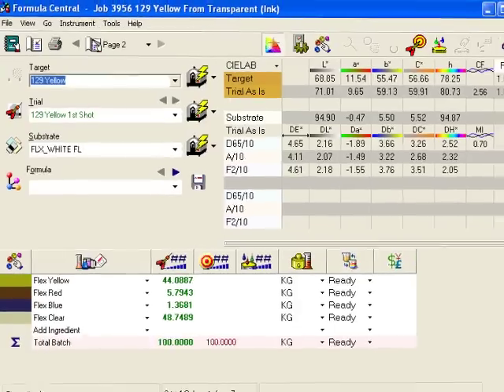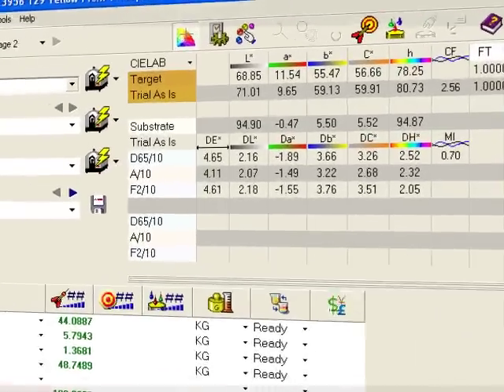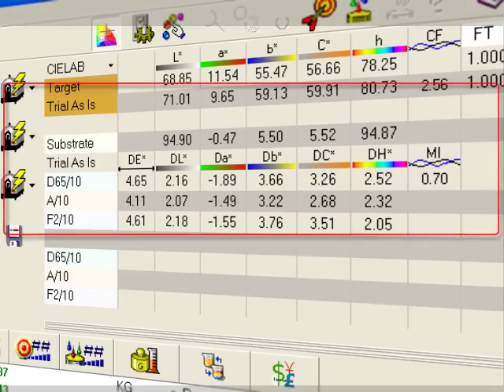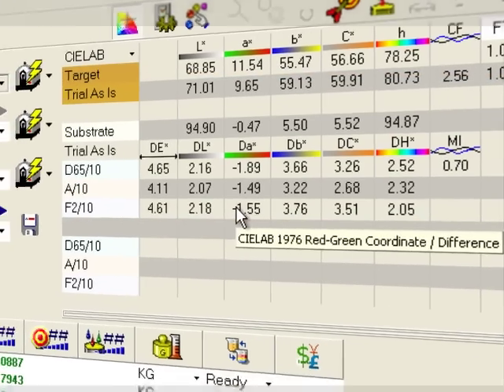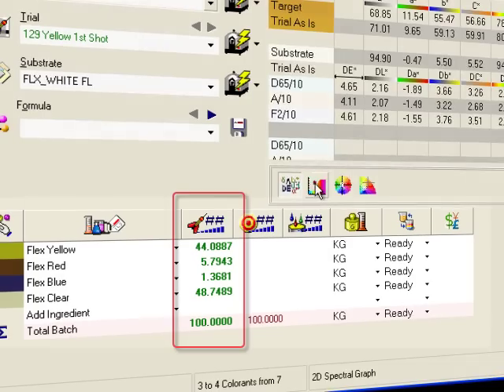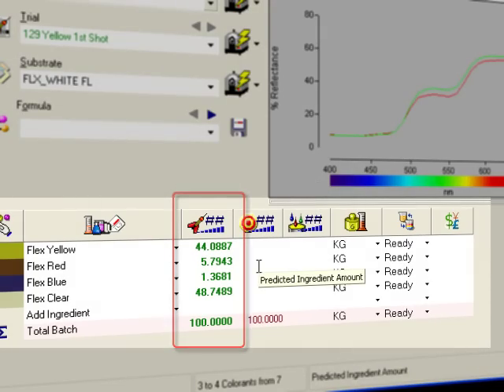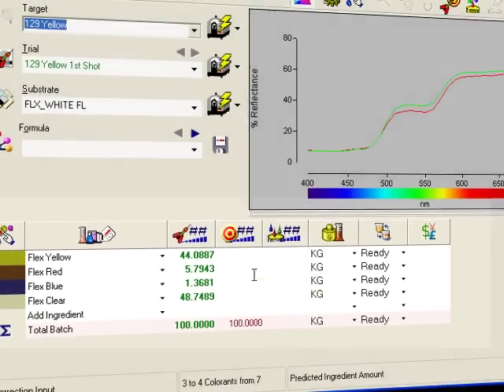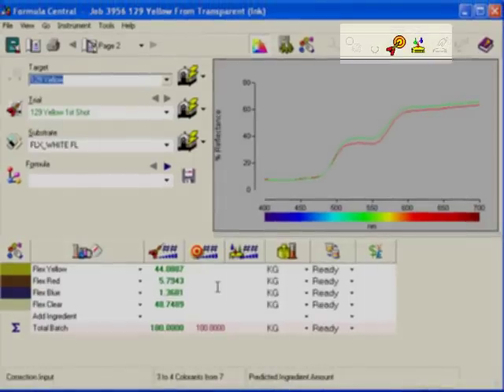The program recognizes that I've measured a new trial and configures the screen for a correction. The evaluation panel now shows color differences and a second spectral curve. The grid has a new column for the trial formula. It's pre-loaded with the target formula from the previous step. The program enabled the correction buttons in the toolbar.